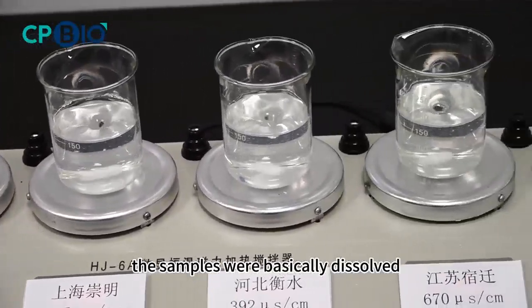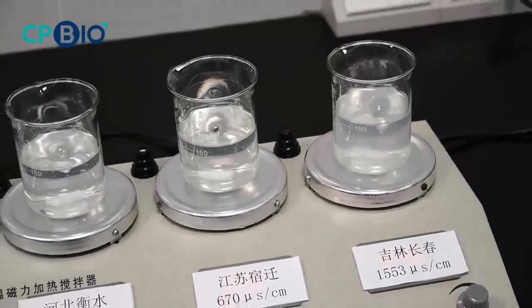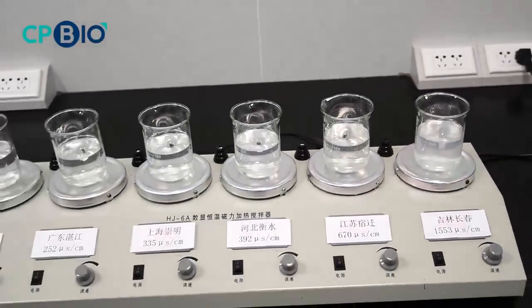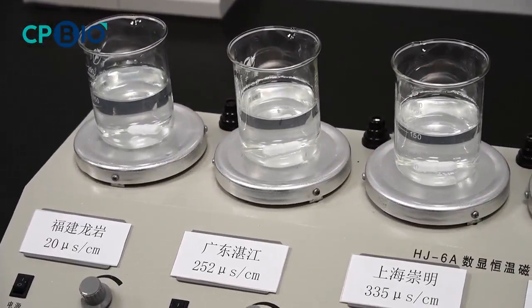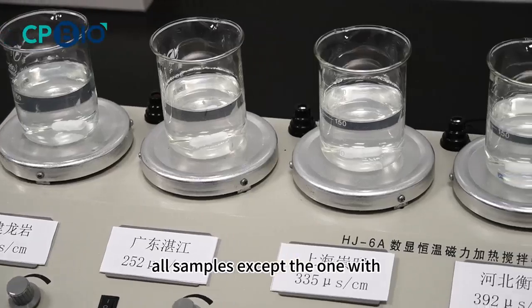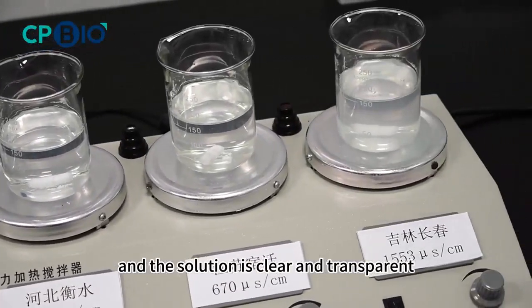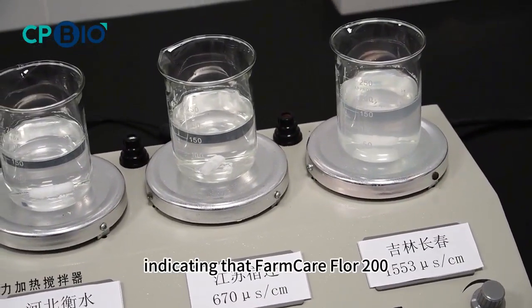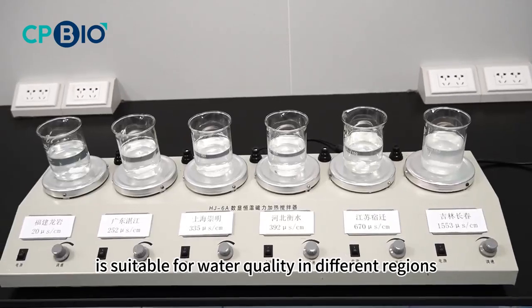After standing for one minute, all samples except the one with the highest conductivity are dissolved and the solution is clear and transparent, indicating that FarmCare Flor 20% is suitable for water quality in different regions.